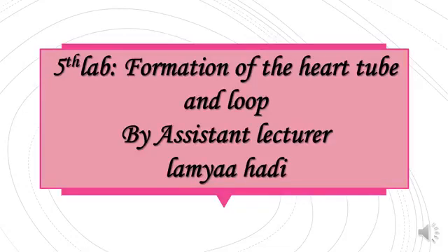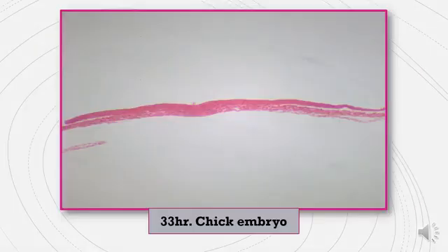Assalamu alaikum wa rahmatullah. In our lab today I will talk about the formation of the heart tube and heart loop. First slide: the chick embryo, 33 hours.